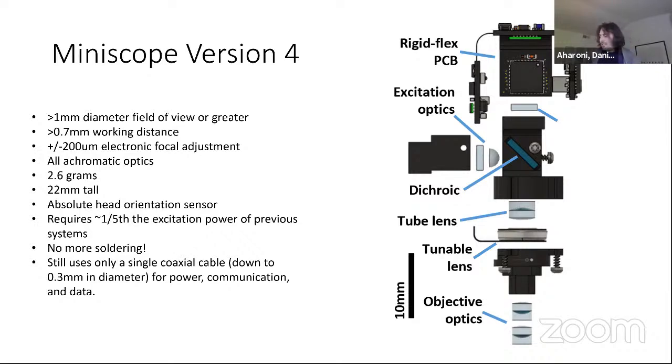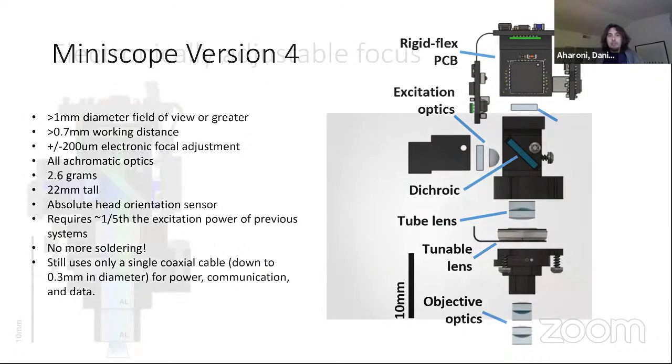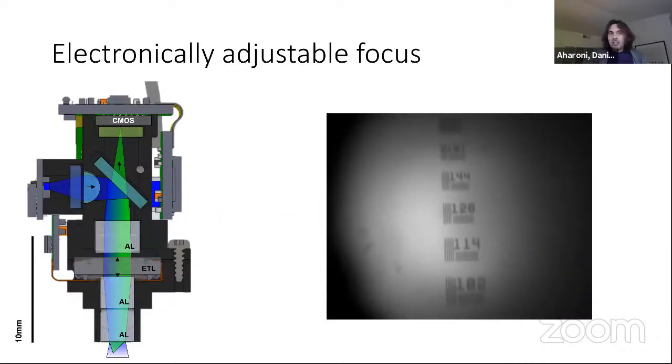And again, they all rely on these thin, flexible coax cables that make it really compatible with freely moving animals. So as I mentioned, we have this electronic focus.